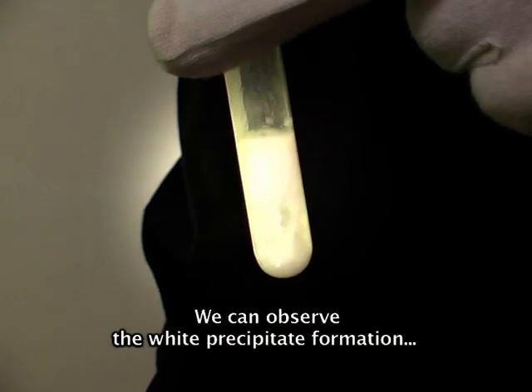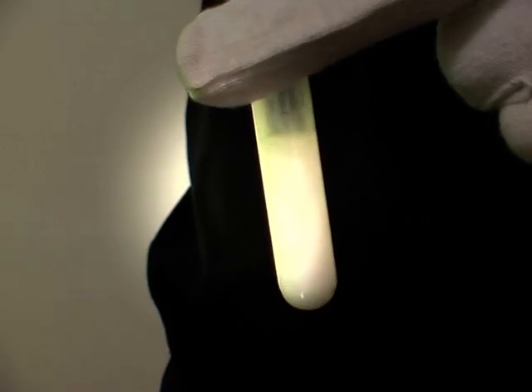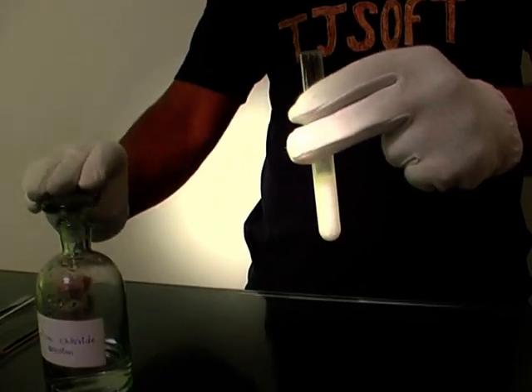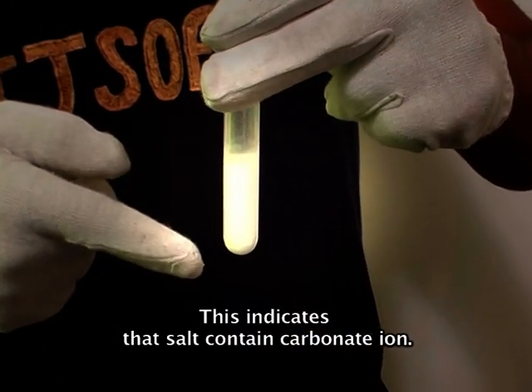We can observe white precipitate formation in the test tube. This indicates that the salt contains carbonate ion.